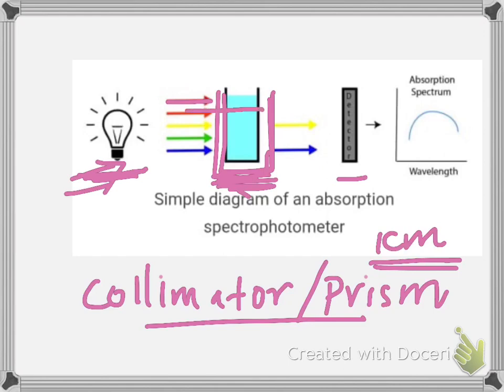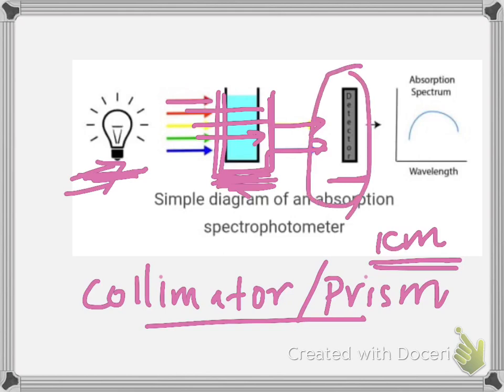After the light passes through the solution, it travels to the detector. Similar to the light source, the exact detector will depend on the wavelength of light.